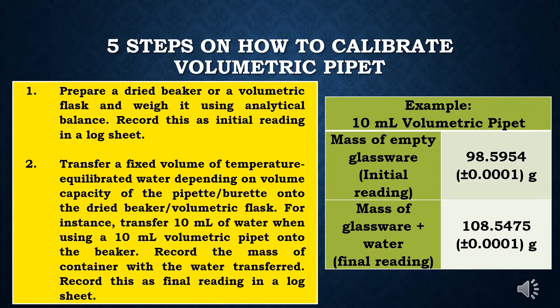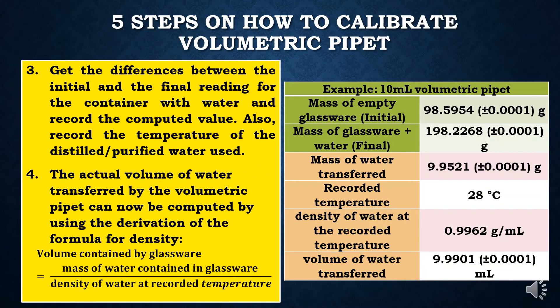Record the mass of the container with the water transferred; record this as the final reading in a log sheet. As an example: there is a 10 ml volumetric pipette to be calibrated. The mass of the empty container is 98.5954 grams. When the water was transferred onto the container, it now weighs a mass of 108.5475 grams.